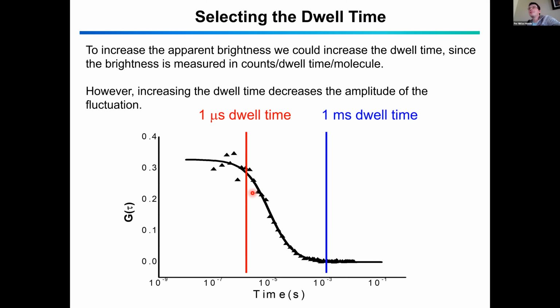So if they move, we still have to be careful because the acquisition rate needs to be faster than the rate of the movement of the molecules. Otherwise, you will average out the movement and again, will not see any fluctuations. If you acquire your data on a laser scanning microscope, most of the time this condition will already be fulfilled and you don't have to worry about it.